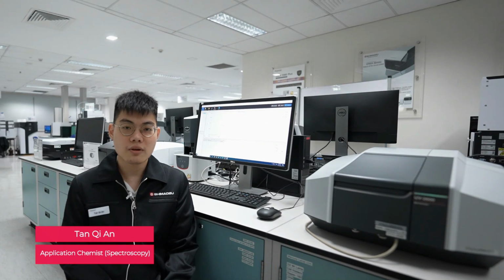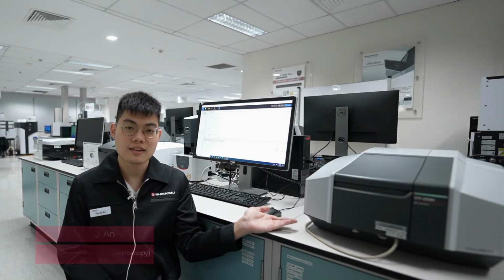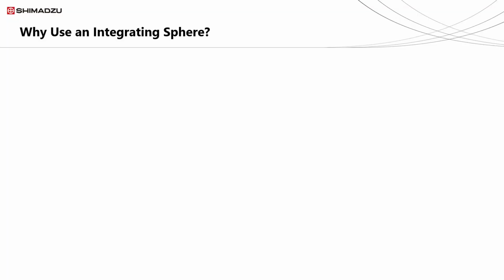In this video, I will demonstrate how to use the ISR-2600 Plus integrating sphere. Firstly, what is the purpose of an integrating sphere?